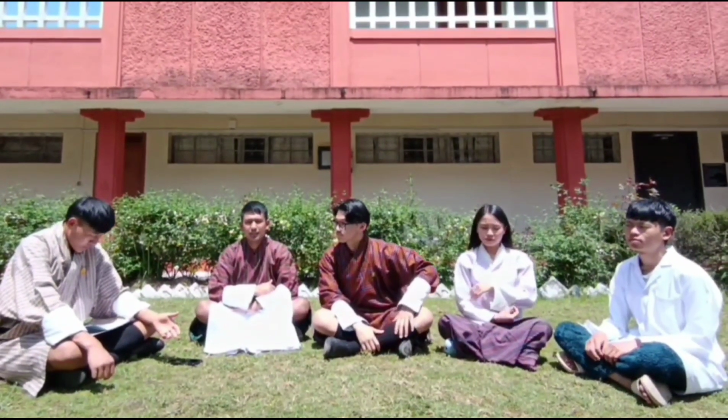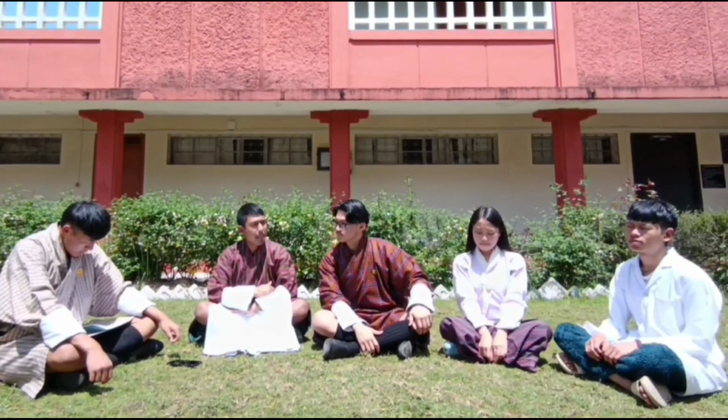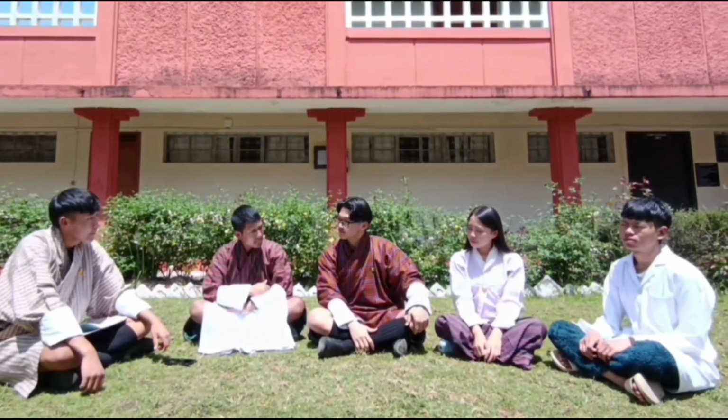Now, we are all familiar with the principle of centrifugation, right? Mr. Tanisiri, can you please share on the cell fractionation process? Thank you for the question.